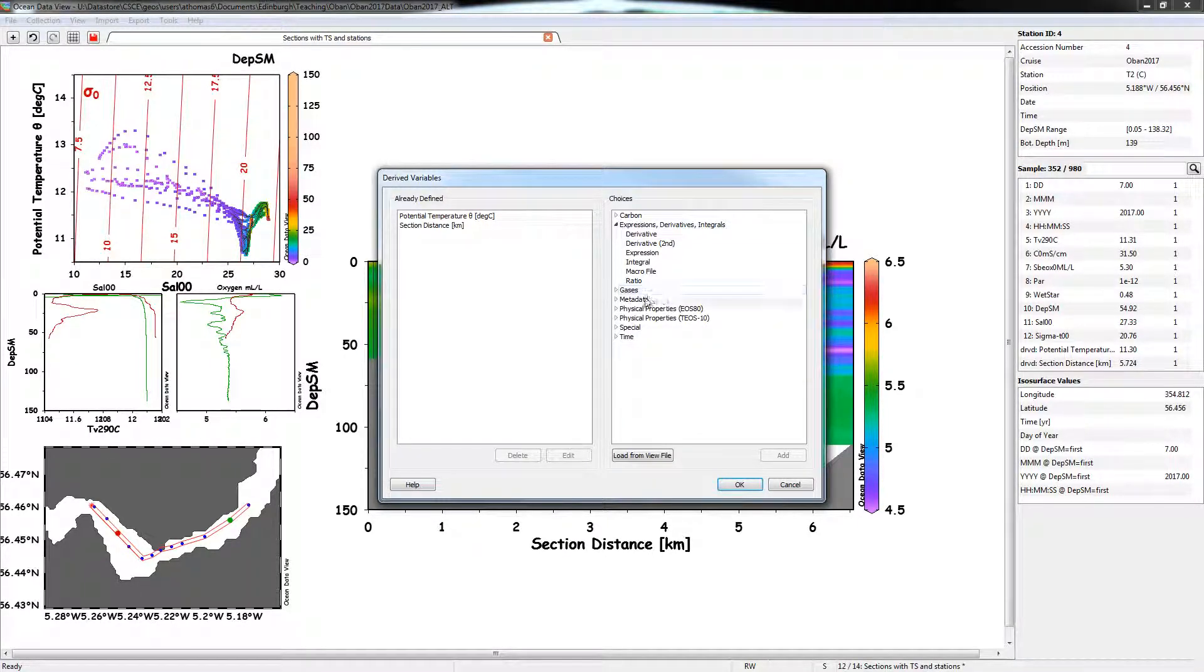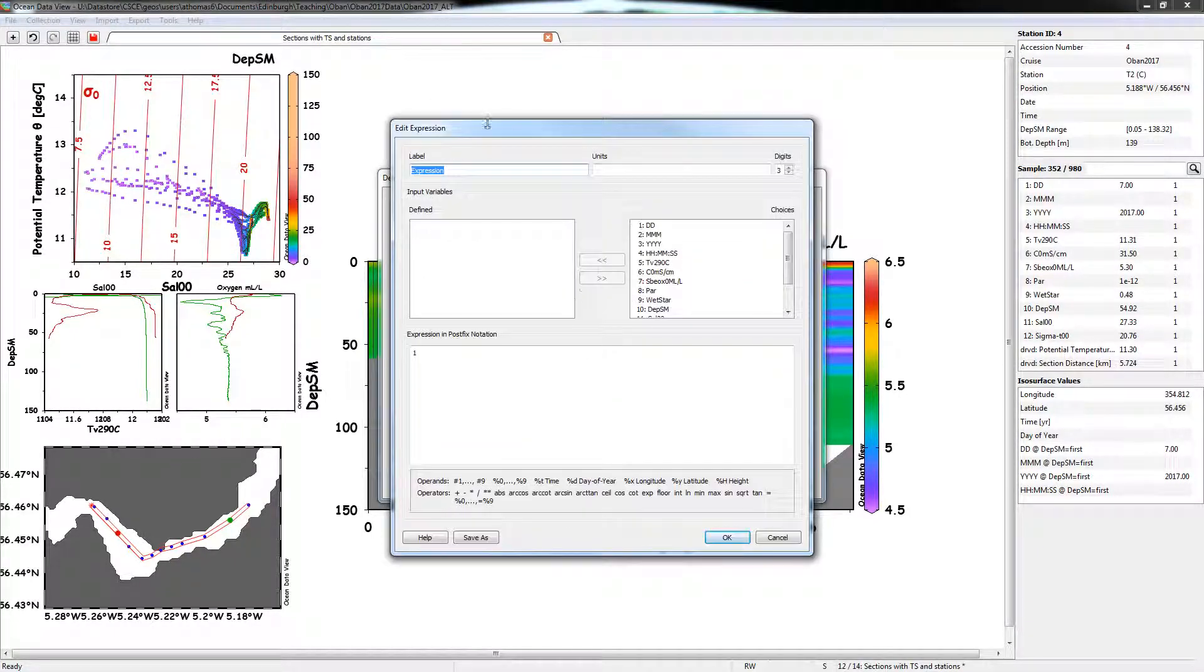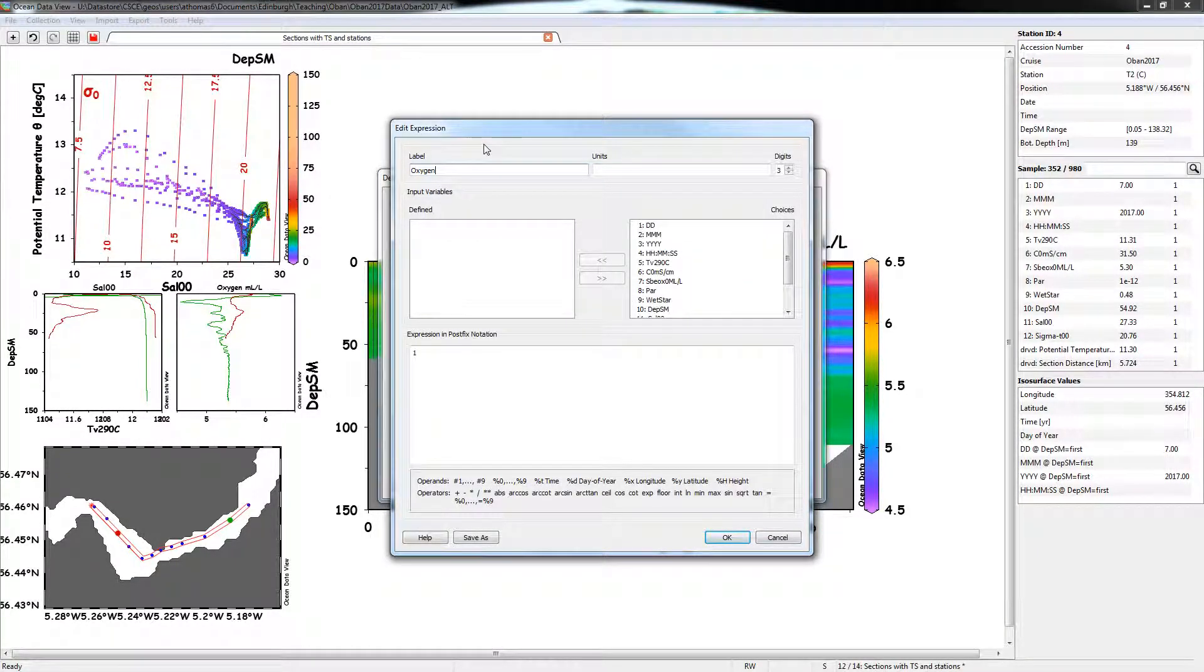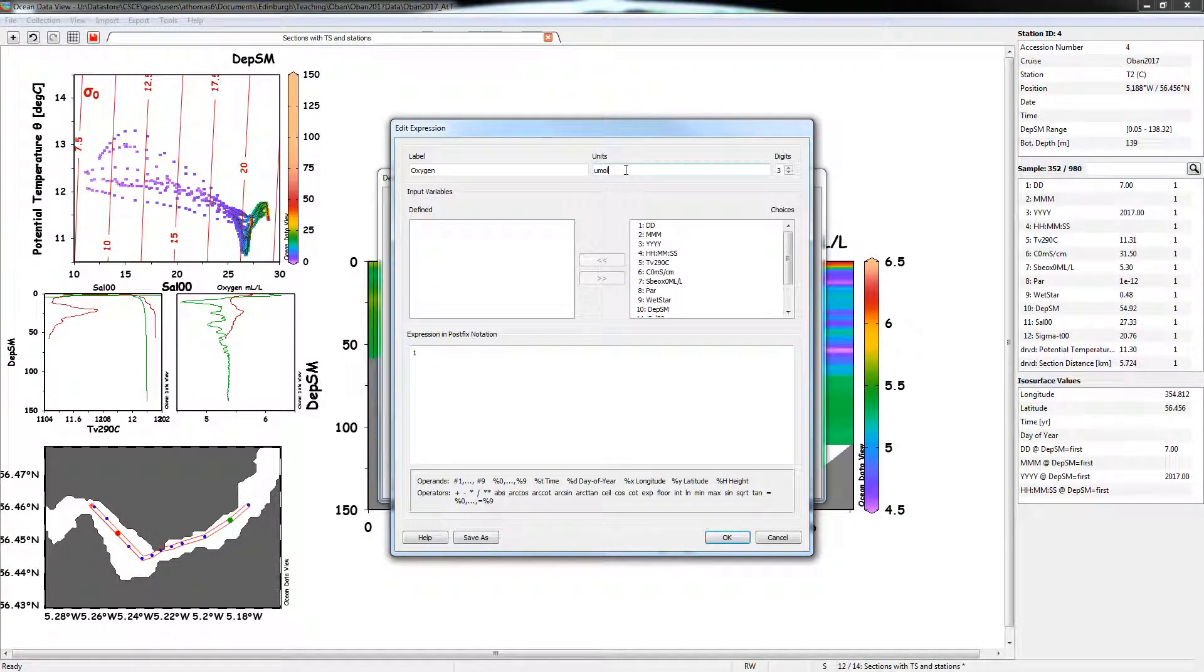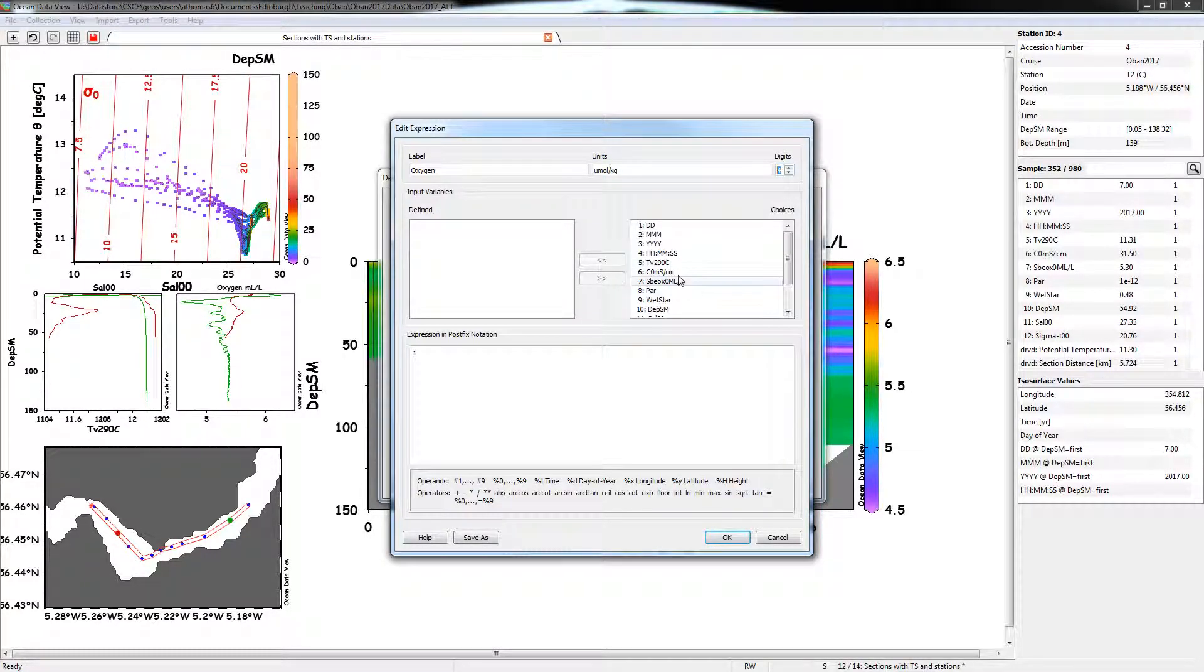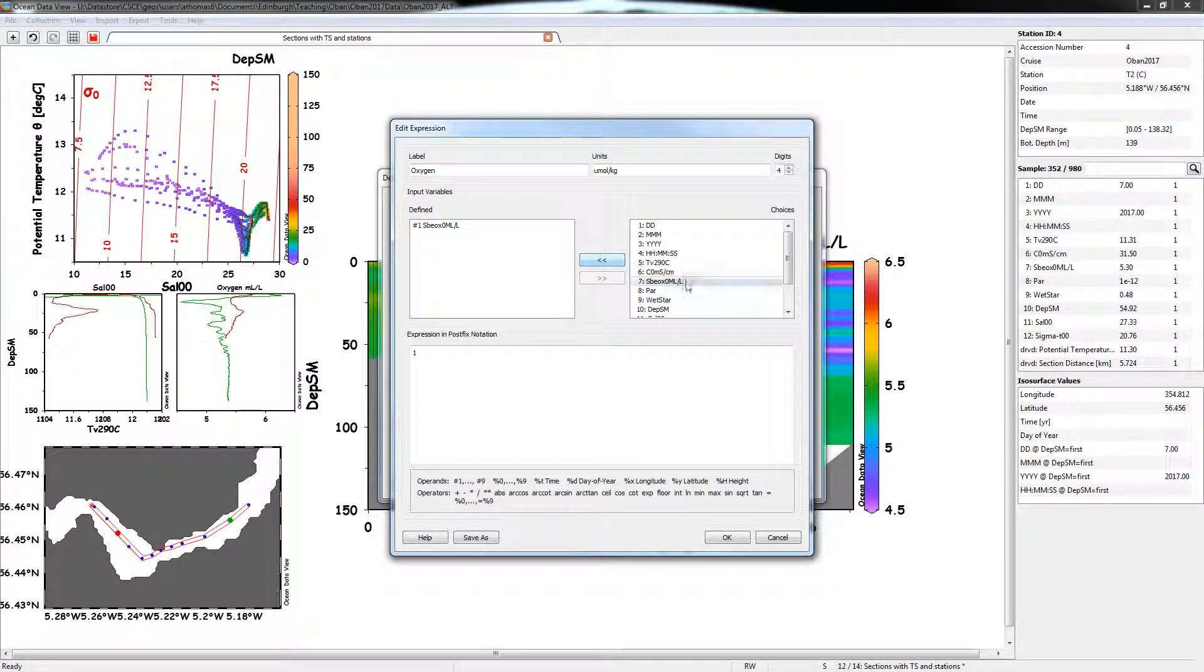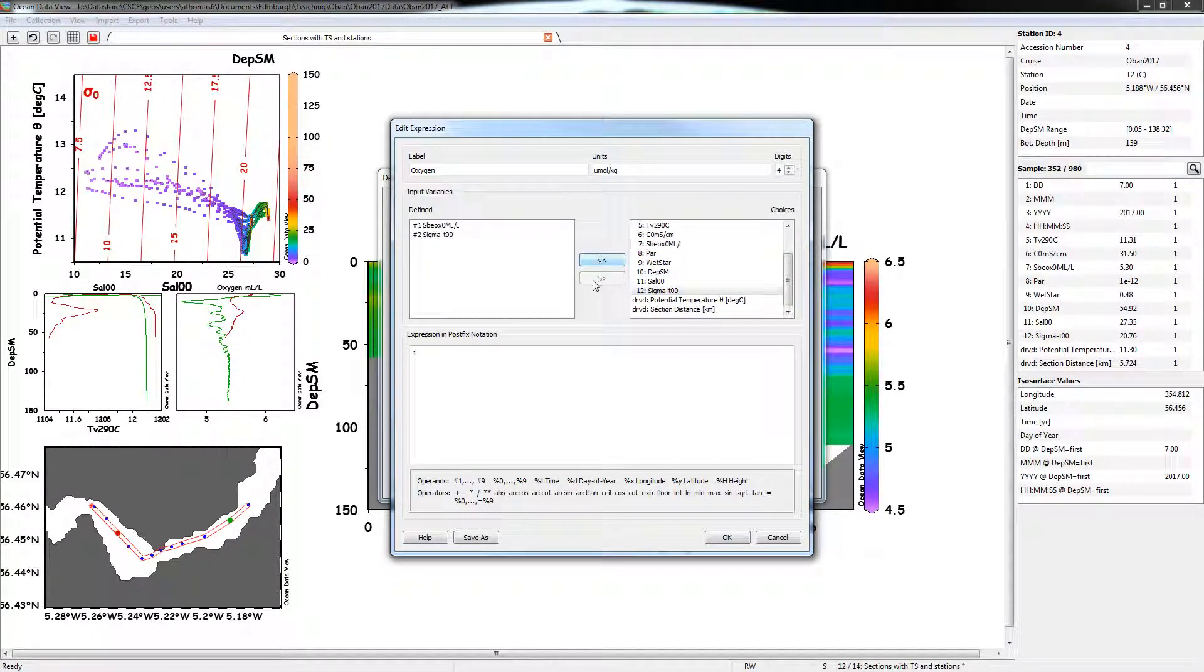So we can then go back now to our derived variable and try and calculate this new thingamajig. So if we go again to expressions, expressions, we're going to add one, it's lost all that stuff we put in before, so oxygen, and the units are going to be micromole per kilogram. Give us some more units. We're going to need the oxygen concentration in milliliters per liter and the density anomaly.